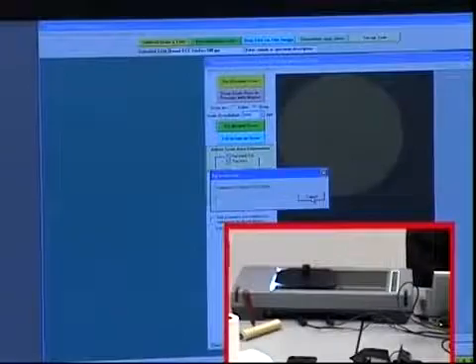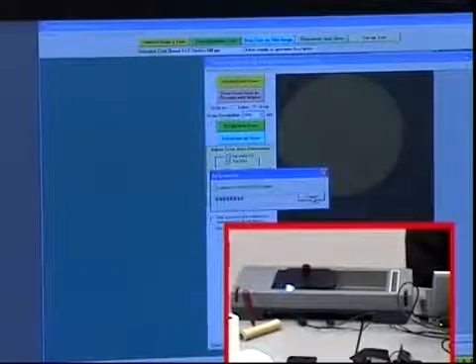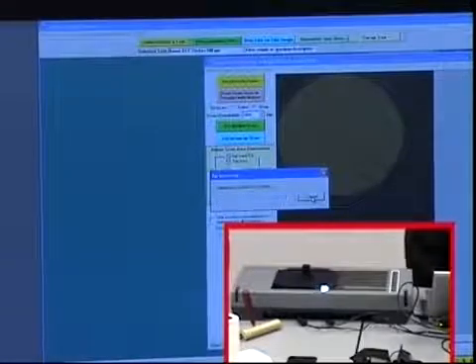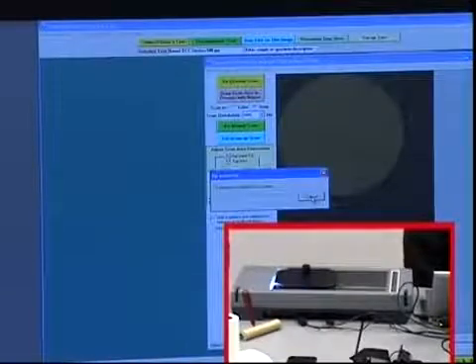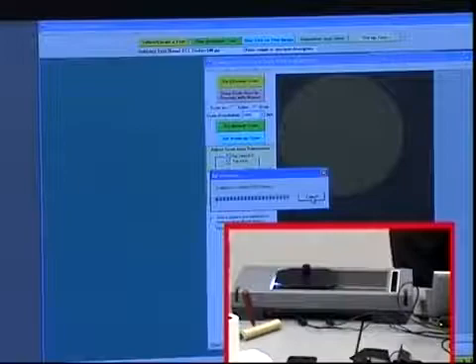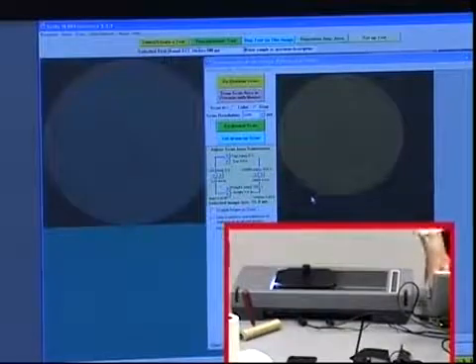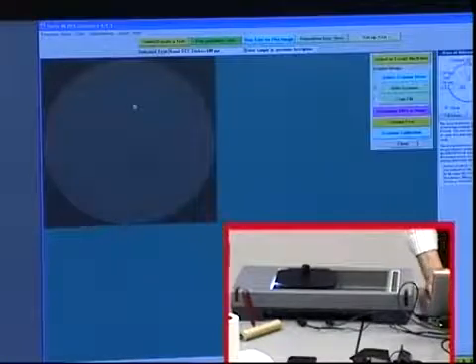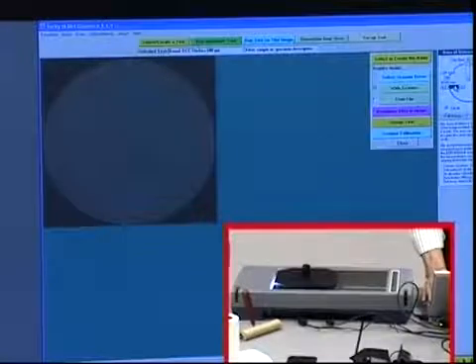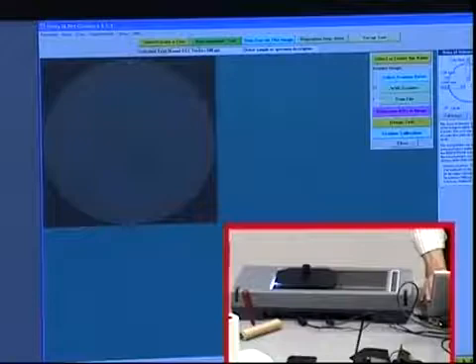This is a very simple test. It is not as involved as running on the Pulmac, and it gives some of the results that a Pulmac would yield. It is sensitive only to those low melt point waxes that will melt in the hand sheet dryer. We'll center the area of interest, eliminating any edge effects, although we do have a nice fat sticky at the top.